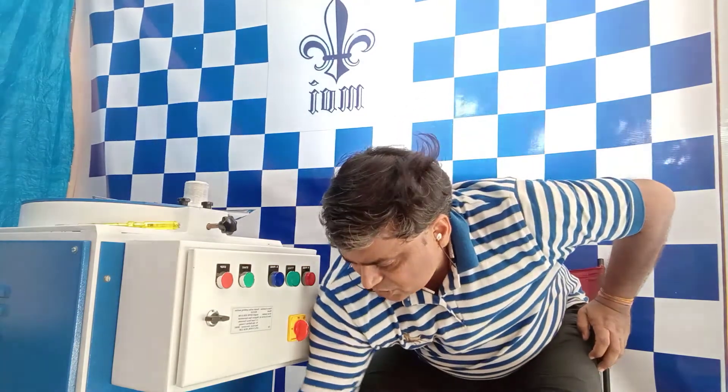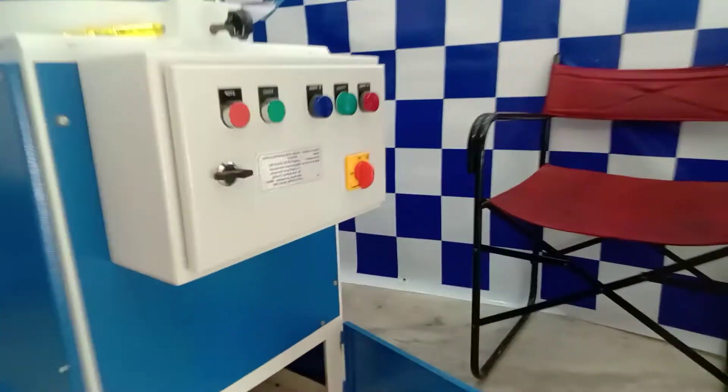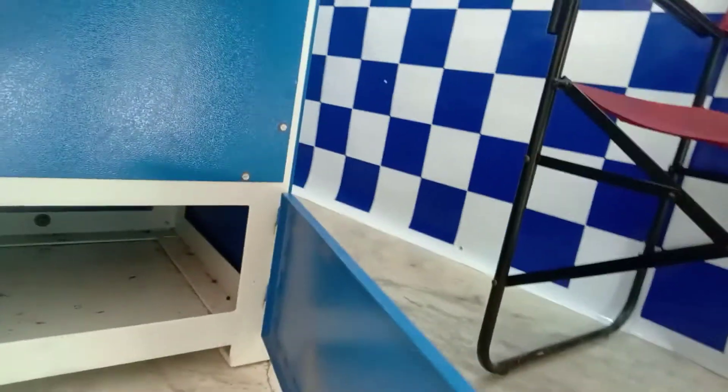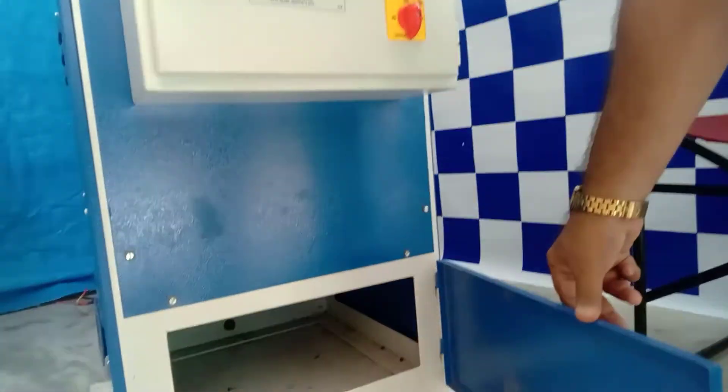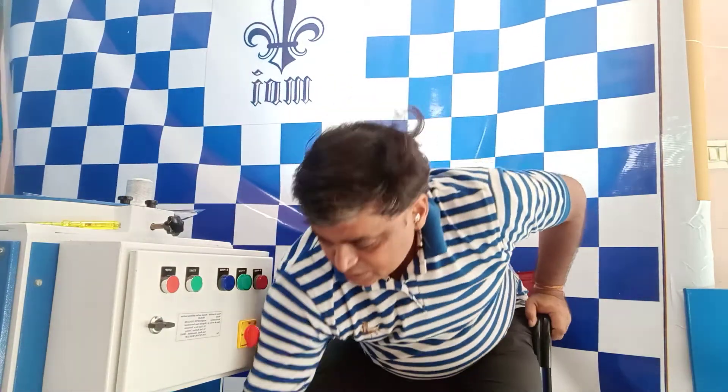If you look at the bottom of the machine, we have made a special rack. This was a design decision — other machines of the same height don't have this feature. We thought about the customer: there is space, so let us create useful storage within the machine itself where you can keep spares and consumables related to this machine. That is a great idea for the benefit of the customer.